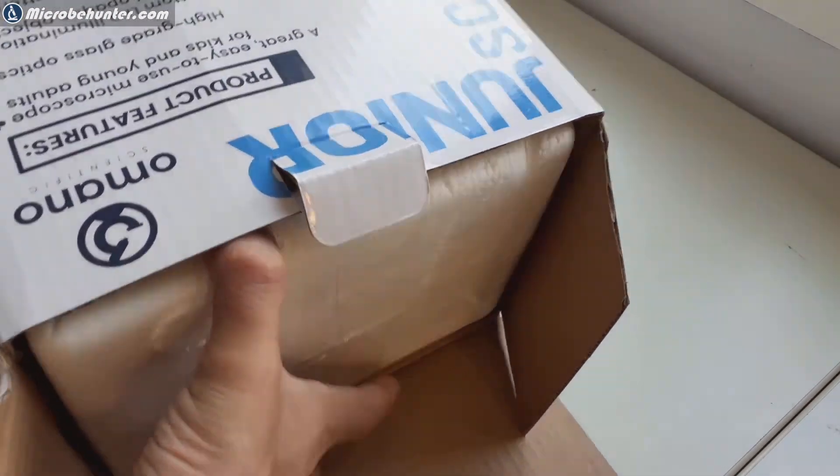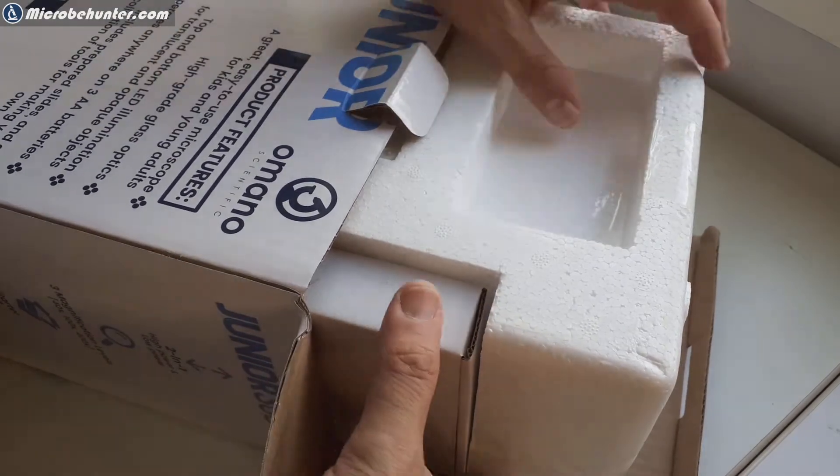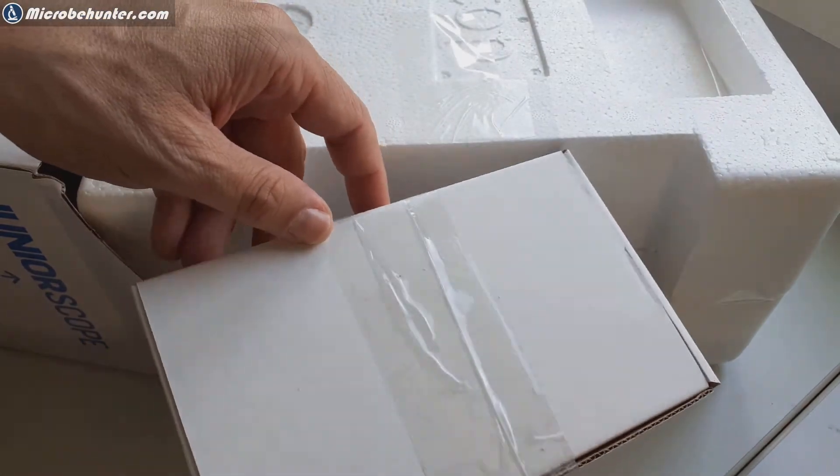So let's take out the styrofoam box. There is a cardboard box here on the side I found out. And so I was kind of wondering what's in it and as a matter of fact there are a whole bunch of accessories included.